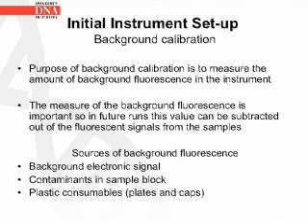The next calibration that is done is the background calibration. The purpose of the background calibration is to measure the amount of background fluorescence in the instrument.